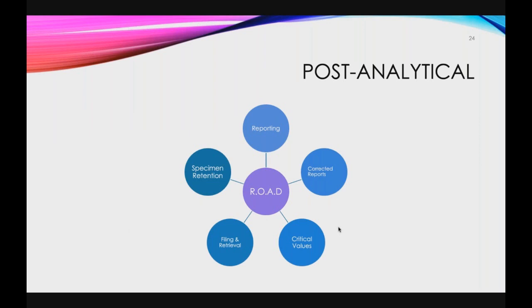Before I go into post-analytical, I just want to go back. I can share with anyone who is interested a company that has these labels that just came out very recently. On it are reagent labels, and on the bottom it has all of the pictograms already on them, and all you have to do is check off whichever one has the pictogram, instead of having a label and then getting your individual pictogram labels and stickers and sticking them on. I mean, it looks horrible, and especially they get wet.